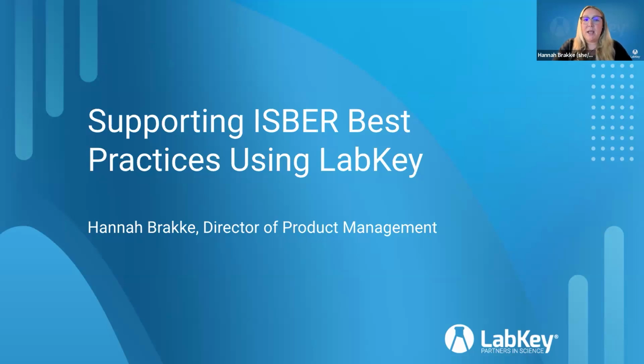What we'll be doing is walking you through how LabKey software helps support biobanks in aligning with ISBER best practices.